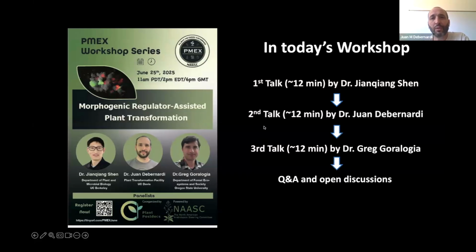So I prefer a faster protocol that will induce embryos quickly. Those embryos can be chimeric, but most of the time, if you have a very efficient CRISPR tool, they will be biallelic, heterozygote, or even homozygote mutations. Okay.